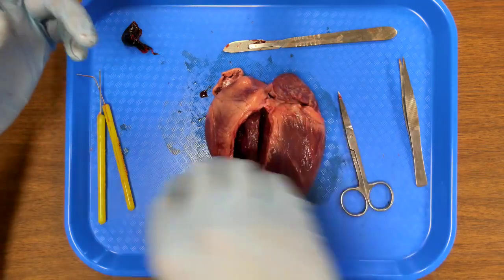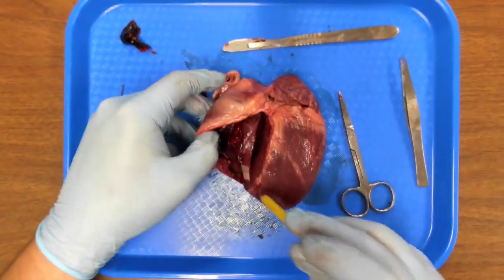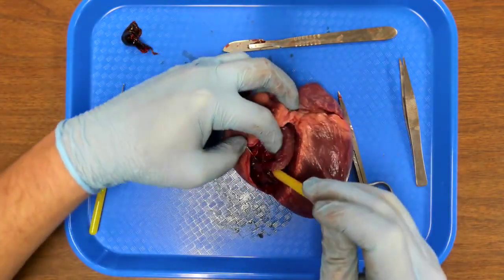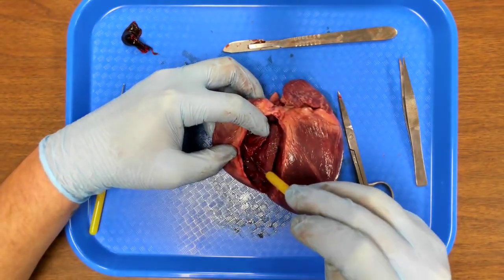Now, inside the ventricle, we don't usually talk about these things, but we've got some thread-like or string-like structures in here. You can see me maybe pulling on them a little bit there.